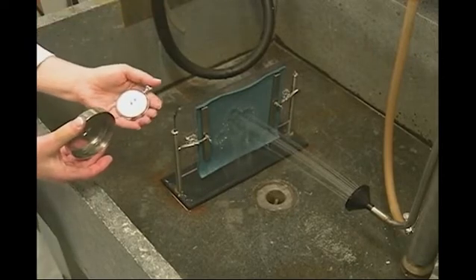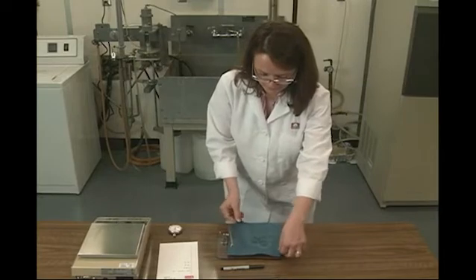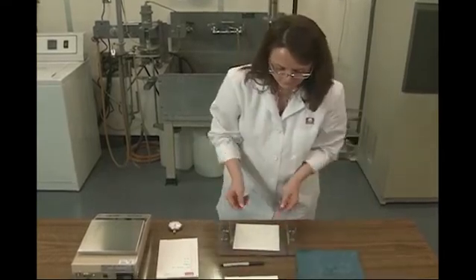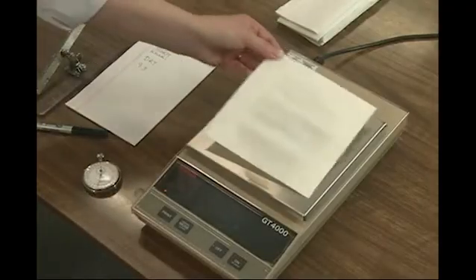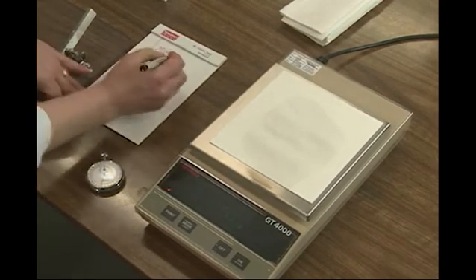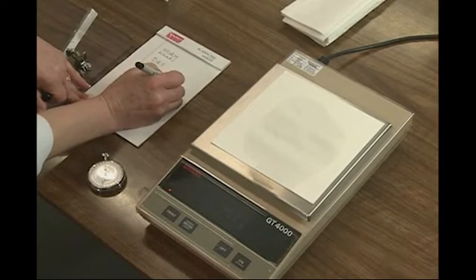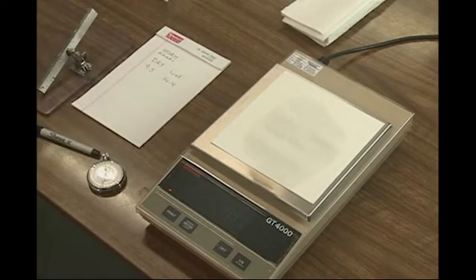After the five-minute water flow exposure, the test specimen holder is taken to a work table where the fabric specimen is carefully removed to avoid any surface water from dropping onto the blotting paper specimen. The blotting paper is weighed immediately, and the increase in mass of the blotting paper specimen is recorded. If the increased mass exceeds five grams, the results are reported with either a plus or greater than sign.